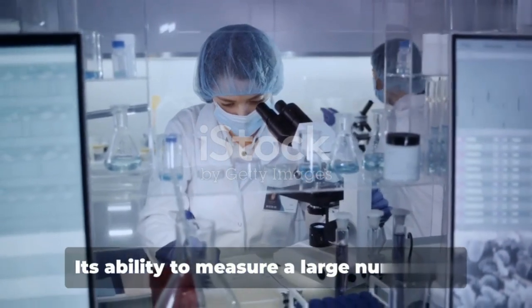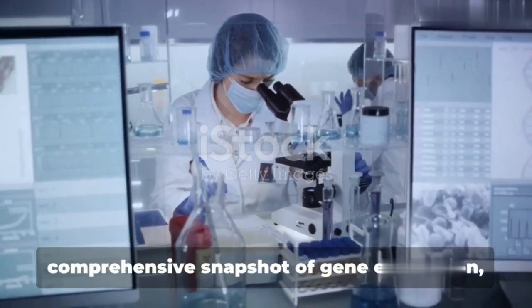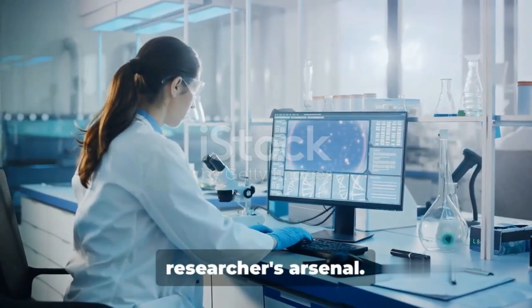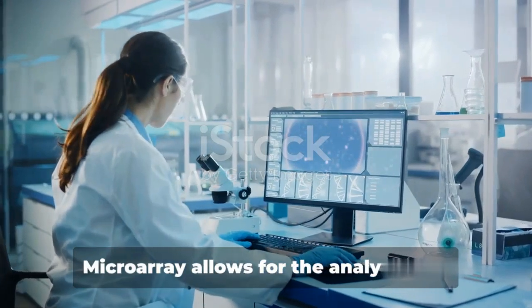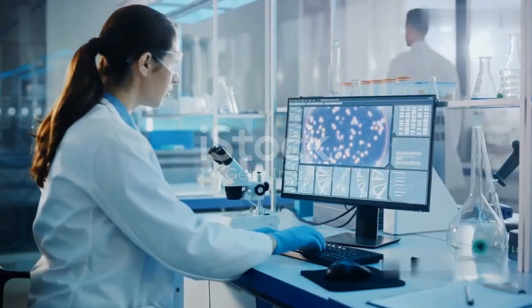Its ability to measure a large number of transcripts at once provides a comprehensive snapshot of gene expression, making it a valuable tool in the genetic researcher's arsenal. Microarray allows for the analysis of a large number of transcripts at once.